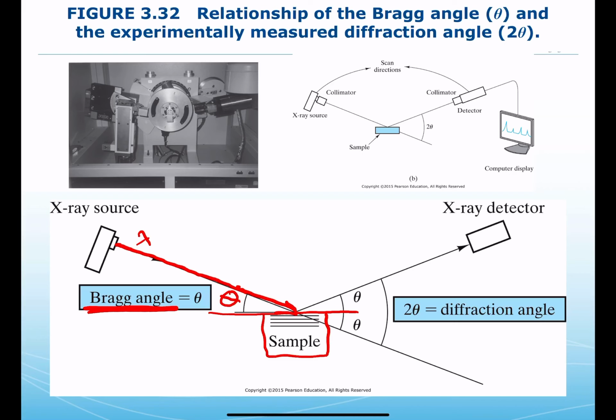And we might expect that if the sample plane was continued and the beam was allowed to pass right through the sample, the path of incidence is here. And so we have, of course, this angle here as our incident angle, theta, again.